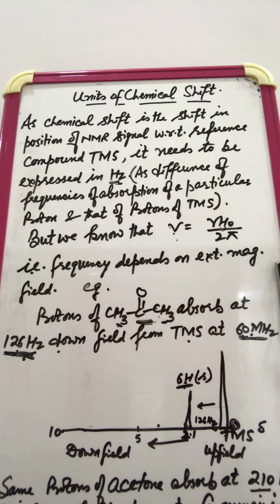This difference in position is measured in terms of difference of frequency. So what we expect is that units of chemical shift should be in hertz.